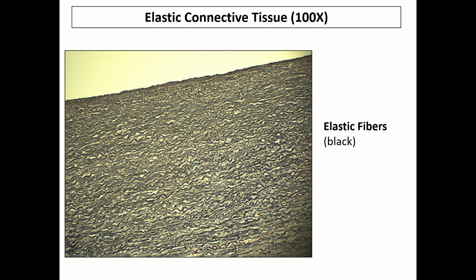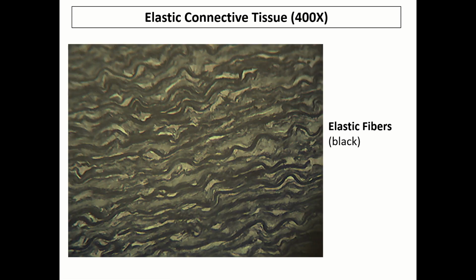The next kind of dense tissue is elastic connective tissue. Here you're looking at the wall of the aorta, a very thick blood vessel, and all of these black fibers that you can see running through the wall of this aorta are all elastic fibers, once again providing recoil whenever this vessel is stretched open. As you zoom into 400x magnification, you get a much better view of these dark black fibers weaving their way all the way around the perimeter of the vessel itself.